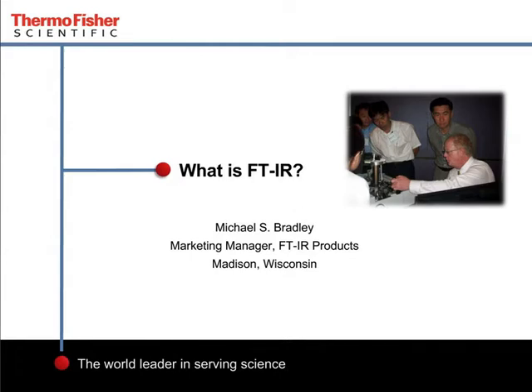Welcome to the first of our short presentations about Fourier transform infrared spectroscopy. This one will cover what is FTIR, just the very basics. Later talks will cover the function of the FTIR and a lot about sampling and the use of the instrument. Let's just jump right in.